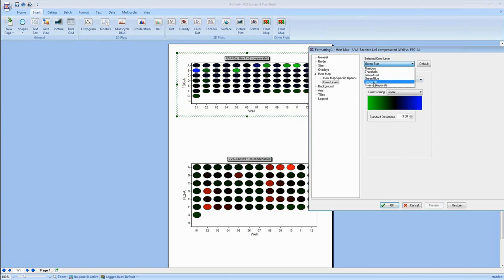And we can take this to grayscale levels as well. So if you only wanted to look at things in gray, we can look at very white values as hot and black values as cold, or we could invert that grayscale and keep this the other way around, where black values are very hot and white values are very cold.